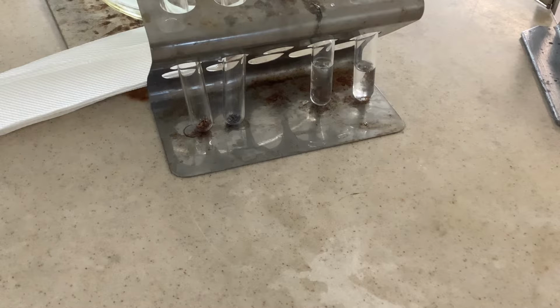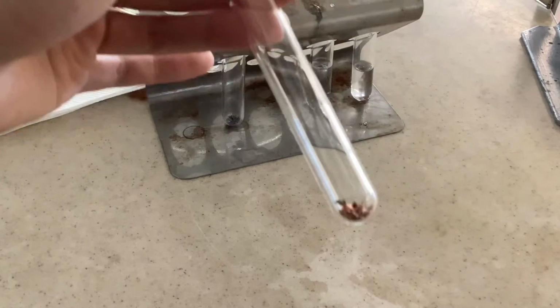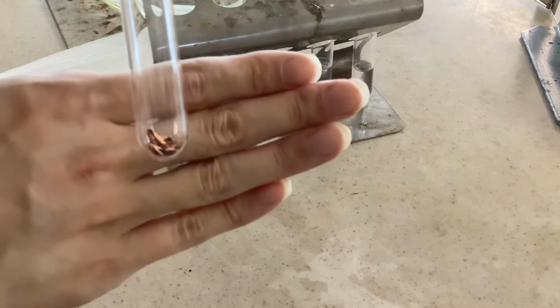In this video, I would like to show you the reaction between some metals with water. And here is the first one, copper metal. Can you see the color of copper metal?